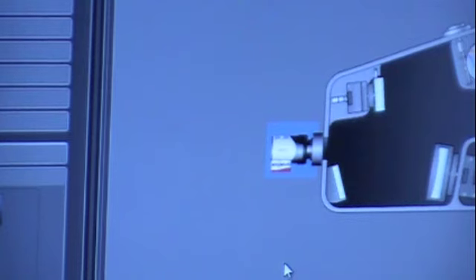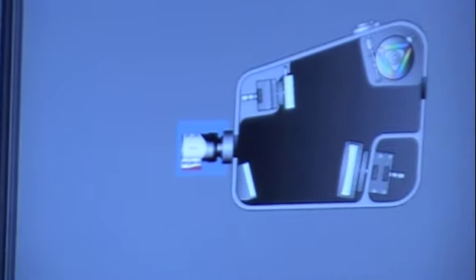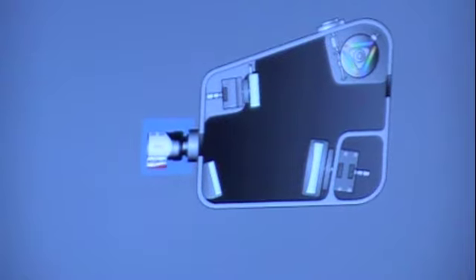So notice as I get the camera closer, there's this green spot at the camera port location of the IsoPlane, and you have to mate them together, as you can see. Now, you don't have to do this, but it makes for a good picture. You can bring a light source up here into the active window.